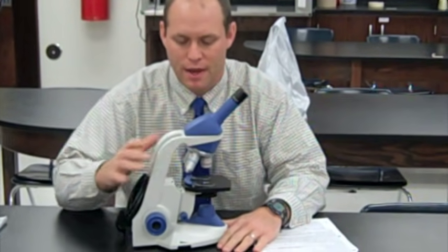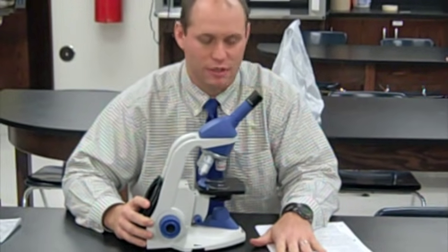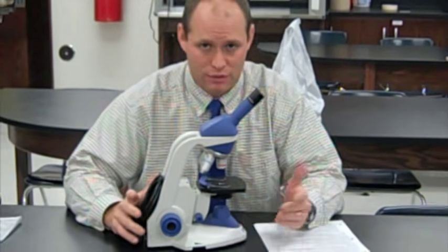Hello 7th graders. As you know, we've been working with the scope, and I want to go over and try to post this online as a video on the operation and handling of the microscope, just in case you were to have a performance quiz. This is what you can go back to study if you needed to.